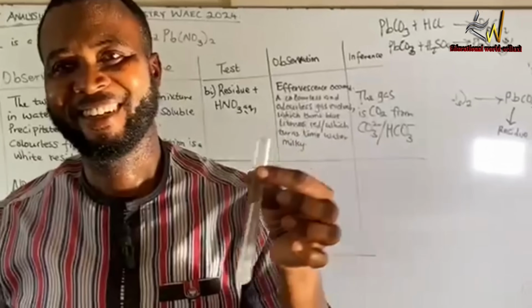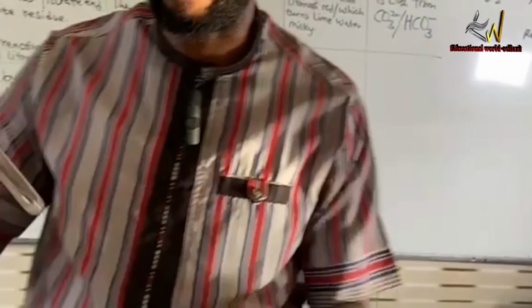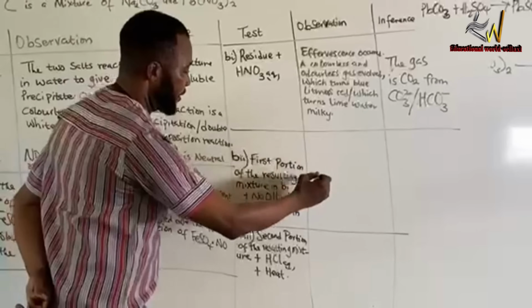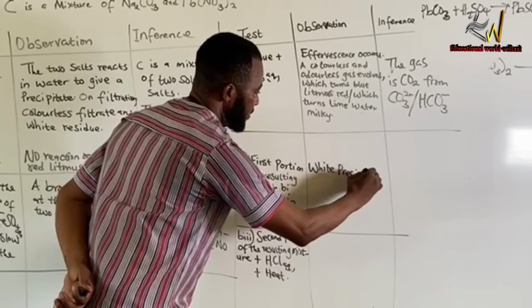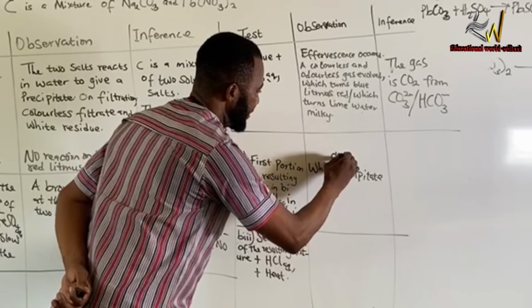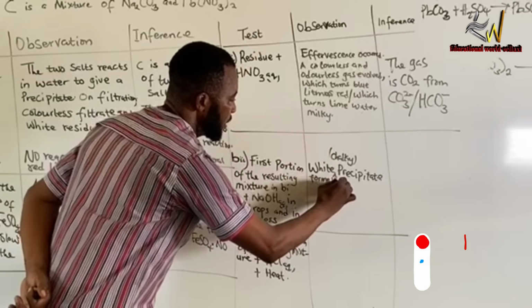Wow. It dissolves. The white chalky precipitates are dissolved. Wonderful. So let's come down here. Your report will be white precipitate, or you might say chalky in bracket, formed in drops.